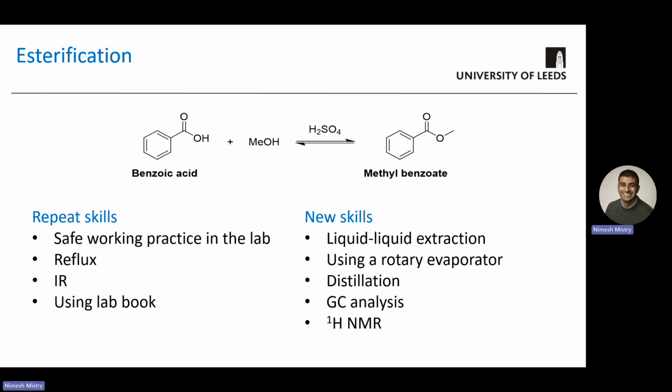So this is called an esterification reaction. It's an acid catalyzed esterification, and you'll learn more about the theory of how this works through your theory modules.